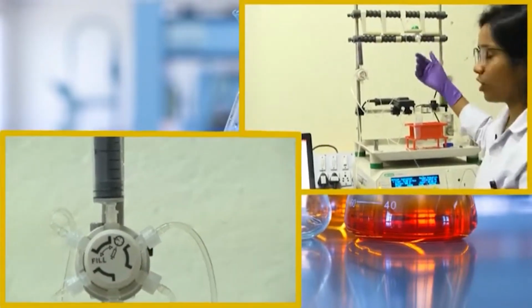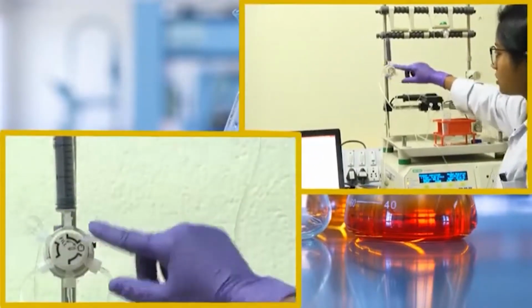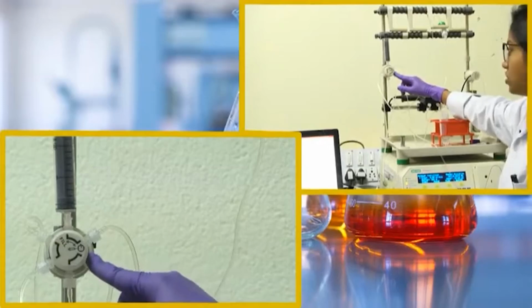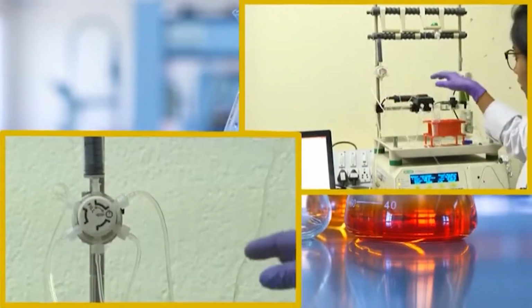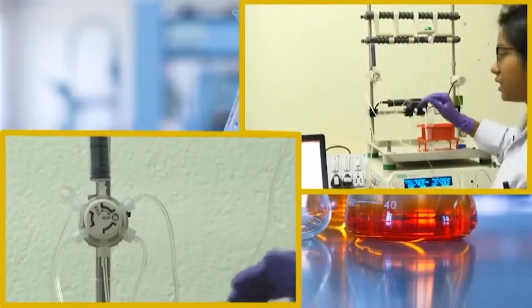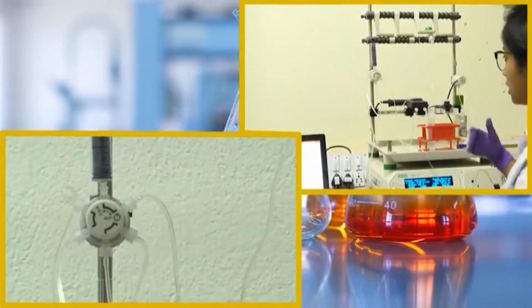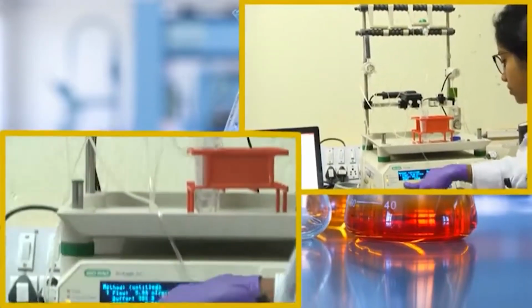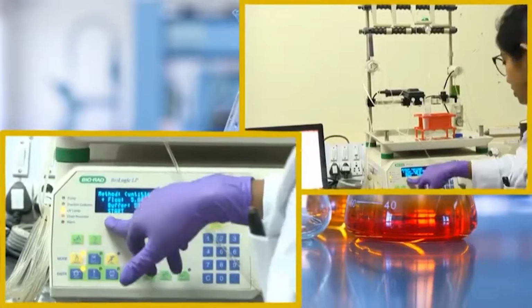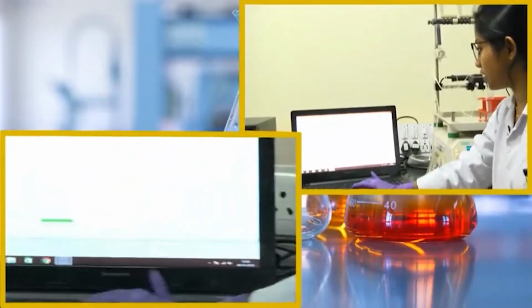If you have a higher volume, just load 10 ml, then twist this thing again back to its original position. Now the channel is linked with this buffer system. Run buffer A, and then after some time you again twist it and load another 10 ml of sample. Now what I will do is start running the buffer A solution, and simultaneously I will start recording.